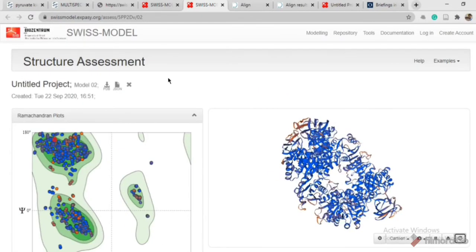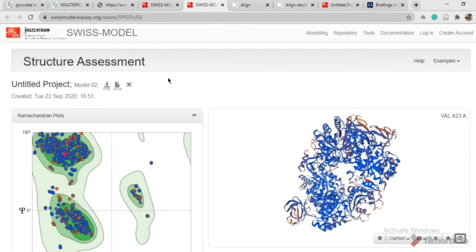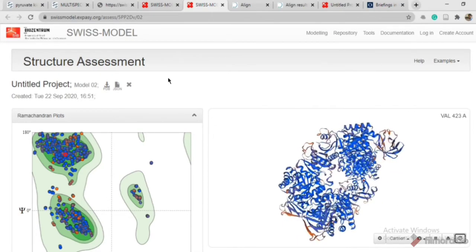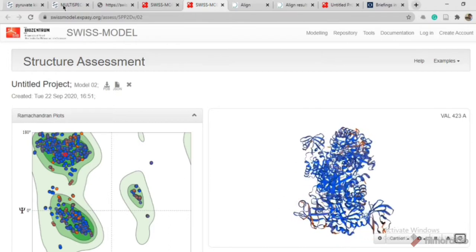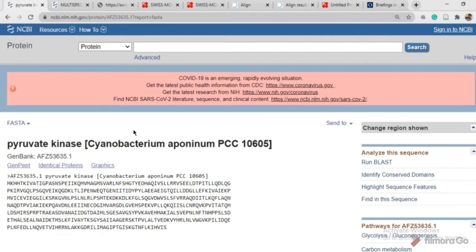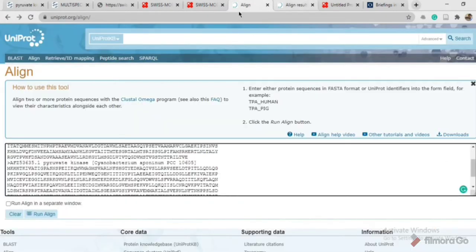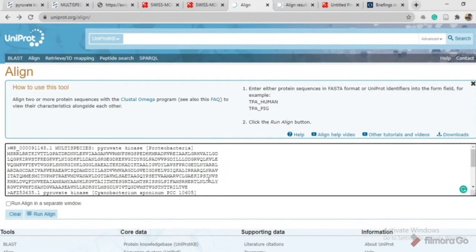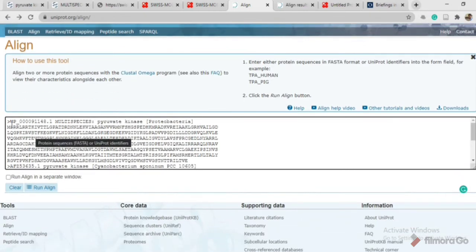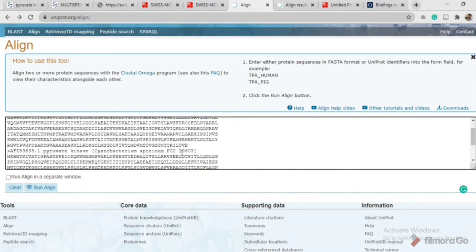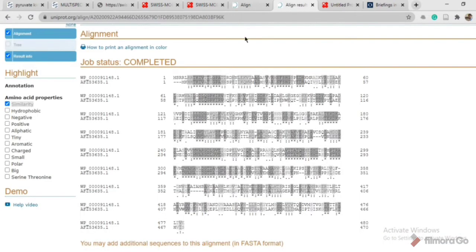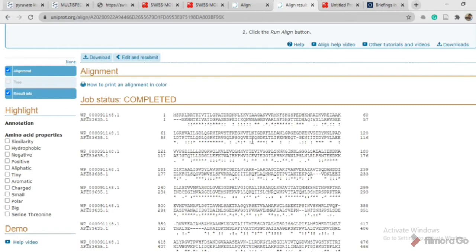Next, if you want to know about the active site of your protein, you have to compare your protein sequence with the same protein from another organism. For example, if you are working on E. coli, search the same protein in another organism — I did it for the Cyanobacterium aponinum. Copy the FASTA sequence for that same protein, pyruvate kinase, then open UniProt and paste both sequences separated with the appropriate sign, then click 'Run Align.'